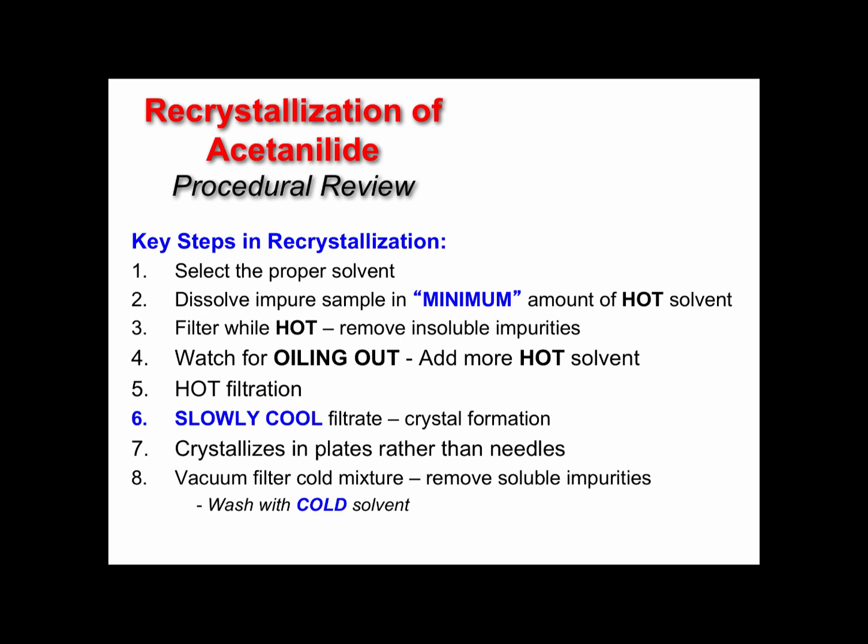Allow it to cool slowly on your bench, sitting on a pack of papers, just so that it cools slowly. This acetanilide forms plates, so it forms horizontal plates rather than needle-like crystals. It looks a little bit different. I think it's kind of cool. Then vacuum filter the cold mixture to get your purified acetanilide, and then wash the crystals with cold solvent, in this case, water.